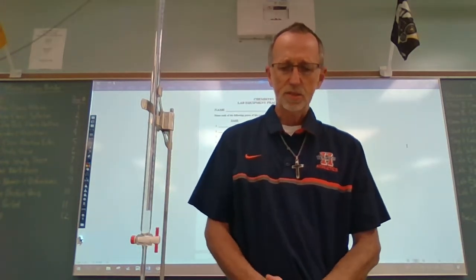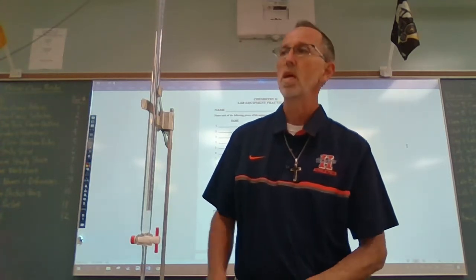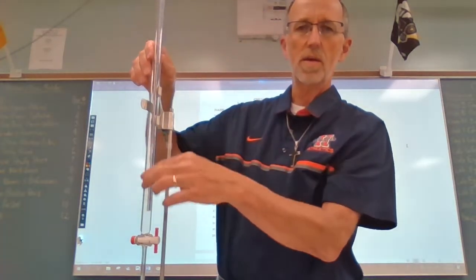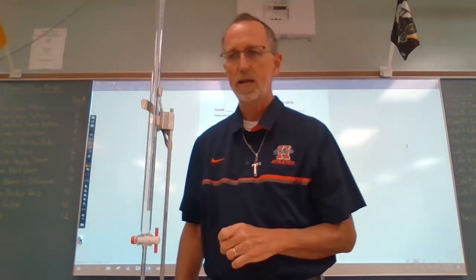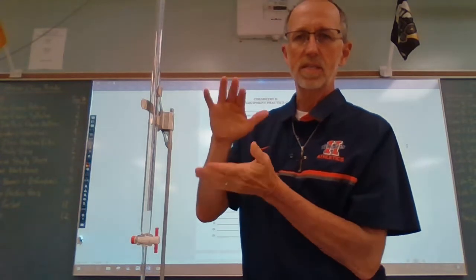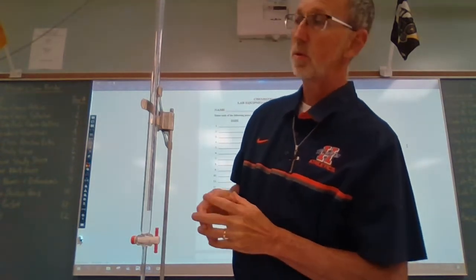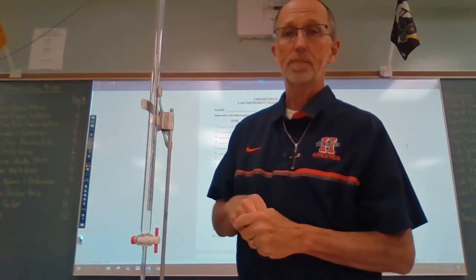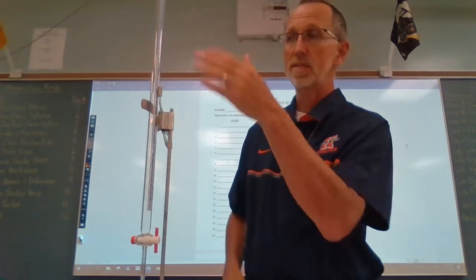A burette is used to dispense a specific volume of liquid. I don't know if you can see very well on here, but there are volume numbers and little markings. We call those graduations. Based on the distance between those markings, we know what volume each one represents.